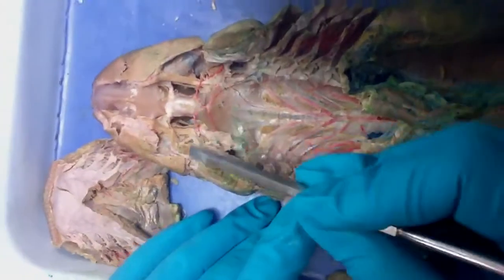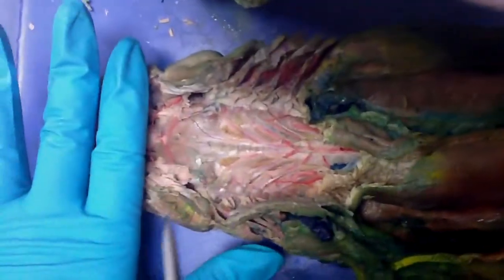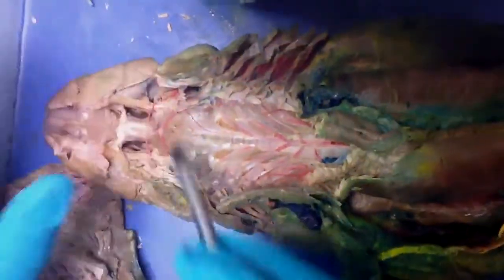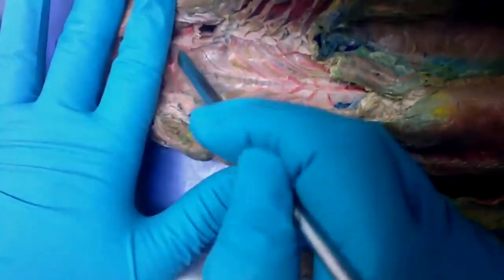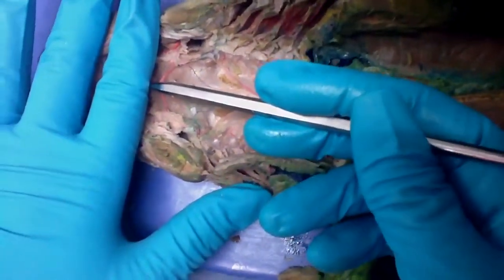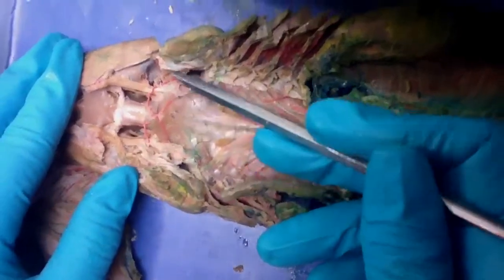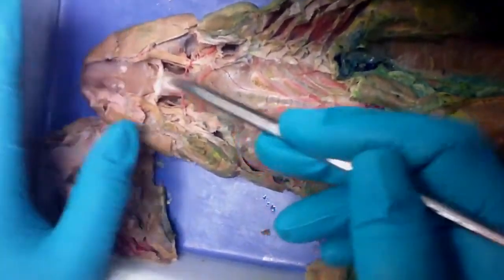And in another shark, no, we didn't dissect that deep enough. Basically, this was inside of something right here, and I broke through the cartilage to expose the rest of it. So this was covered by cartilage. So the carotid arteries go through what is the carotid foramen, and then it splits, and we have the internal carotid arteries here that run on either side.